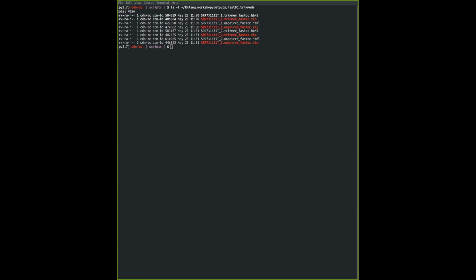Okay, again, I'm going to paste the way to open up any of this file in Etherpad, so you can copy code for Mac or Windows. For you, I'm going to quickly do this and open up for Ubuntu, xdg open, and open up the FastQC file. And you can see, sharing my screen.